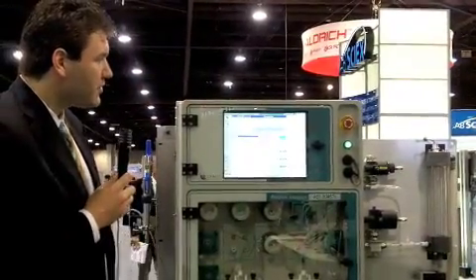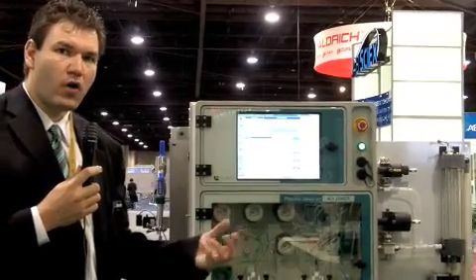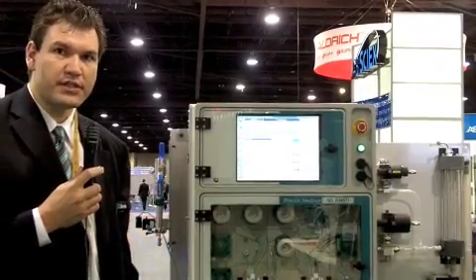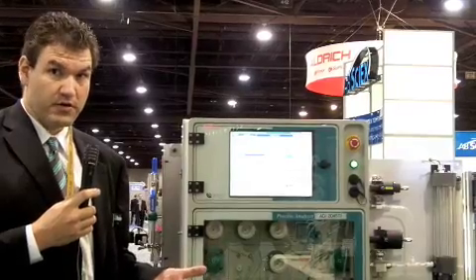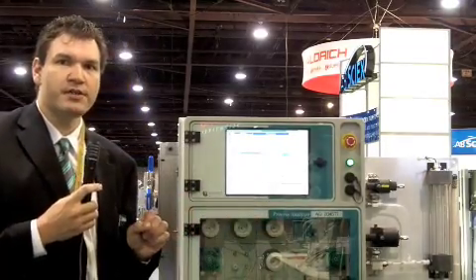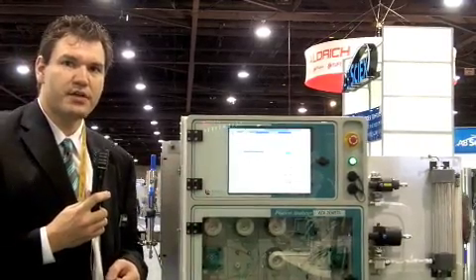The most important thing about this new product is that Metrom takes it very seriously to incorporate all the requirements defined as part of a project into the analyzer. Our projects are developed in intensive cooperation with our customers to ensure all requirements are met. That means no two analyzers are alike — every analyzer is individually customized and adapted to the needs of the application, the process, and the people working there.